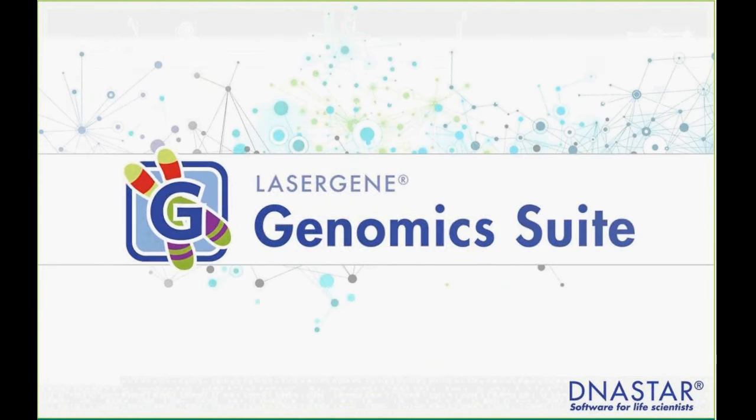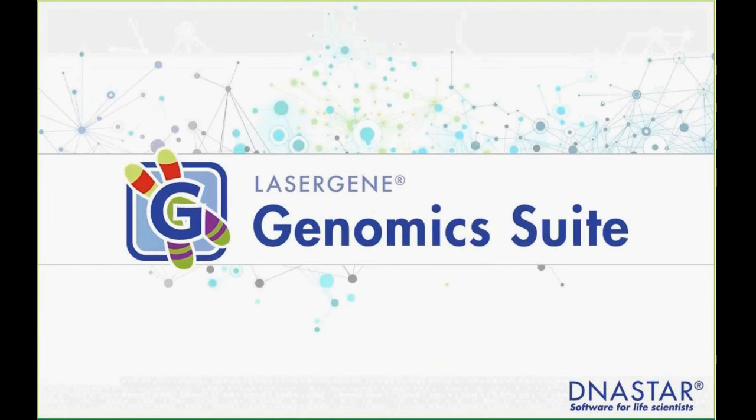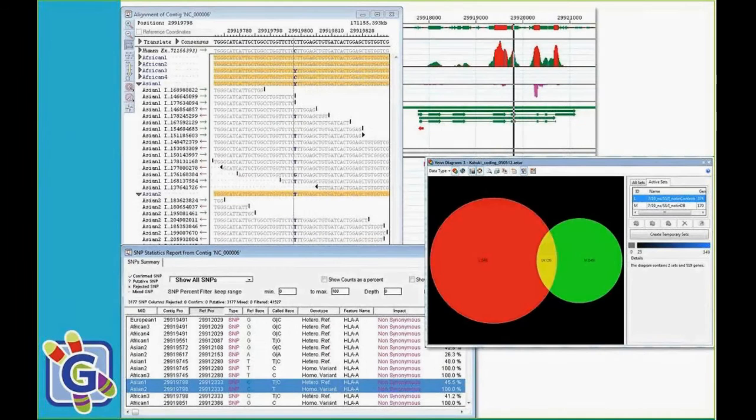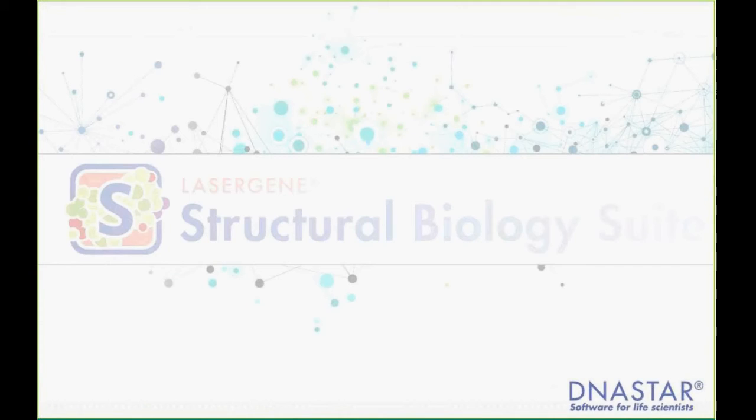We also have some newer software in our genomics suites that we're going to talk about today. The genomics suite, of course, includes assembly software, so it takes raw input data from sequencing instruments and aligns or de novo assembles it. And then we have all different types of downstream analysis tools depending on the different workflow that you have. We also have protein analysis tools.